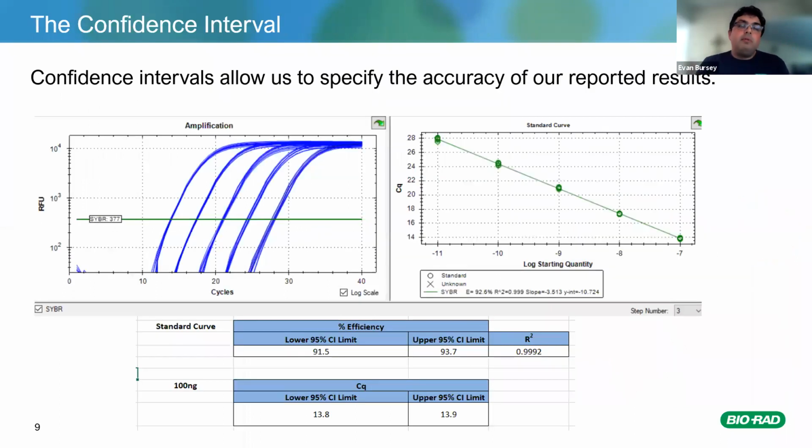When we report out values, I really hate taking a bunch of numbers and crunching them down and reporting out an average. You take all this data and you turn it into a single number, and I feel like you lose a lot of information. So we tend to report our results out as confidence.